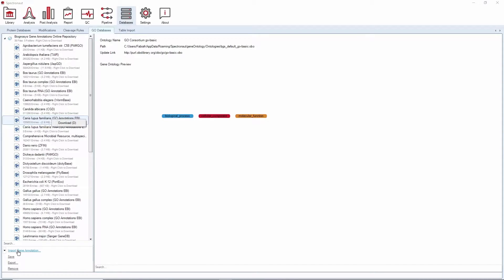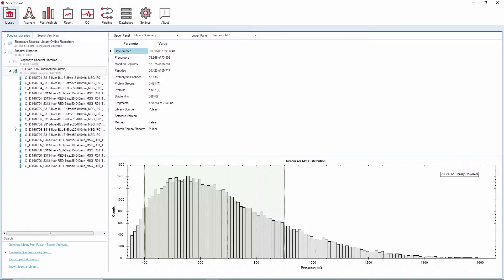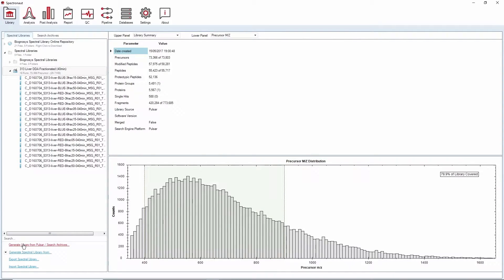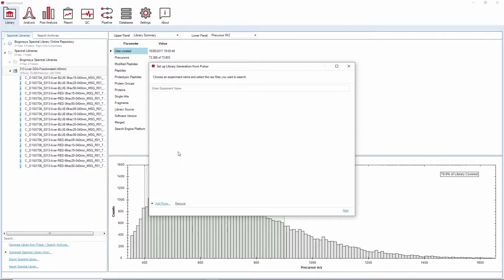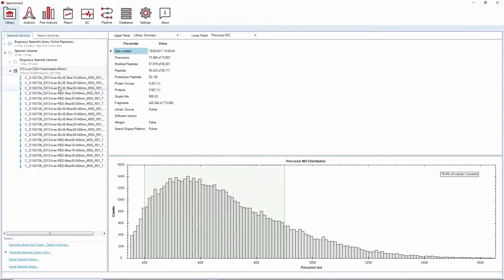If you don't have a Spectron library yet, the third step in a peptide-centric approach is to generate one in the library perspective. By clicking on the action Generate library from Pulsar, you can generate a library with our Spectronaut integrated search engine. A wizard will guide you through all the steps from peptide search to library generation. Upon successful completion, your library will appear in the left panel of the library perspective.